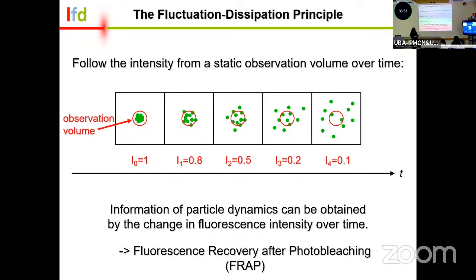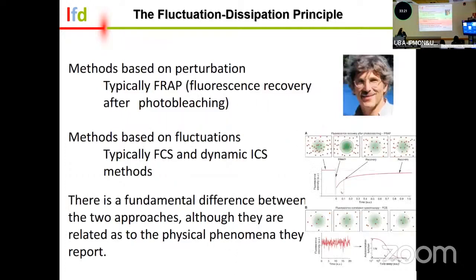And Fick's law states that this is the probability distribution of how molecules will be found later in time at a given distance, right? So we can actually calculate how long those molecules will take to go to a given distance because of their movement and time. So we can measure how fast the substance diffuses, which is directly tied to both the concentration gradient and diffusion coefficient. So how fast those molecules move.